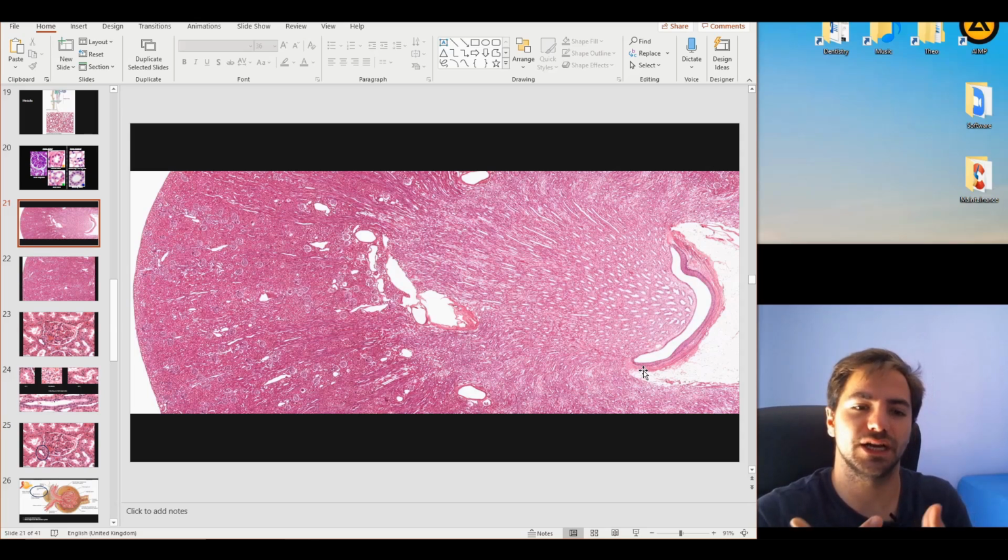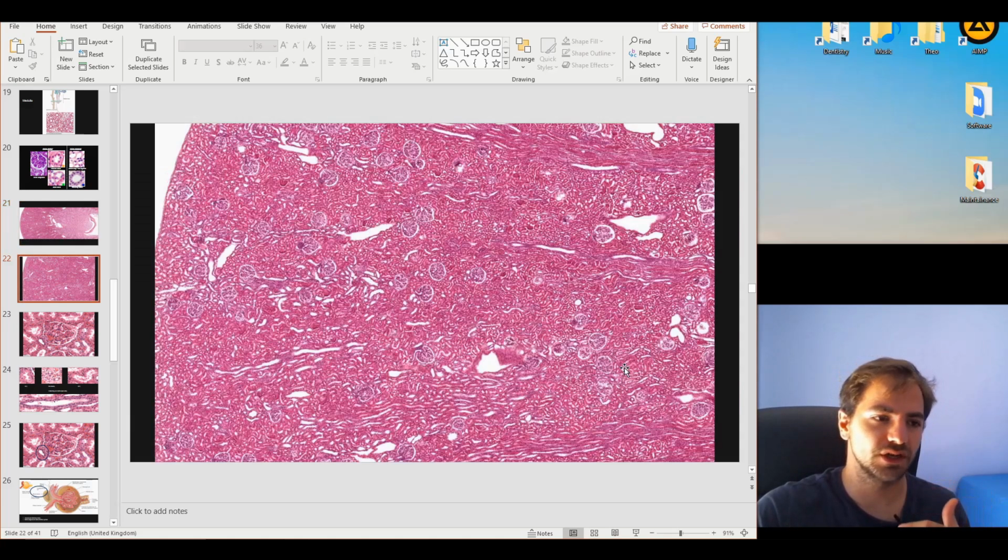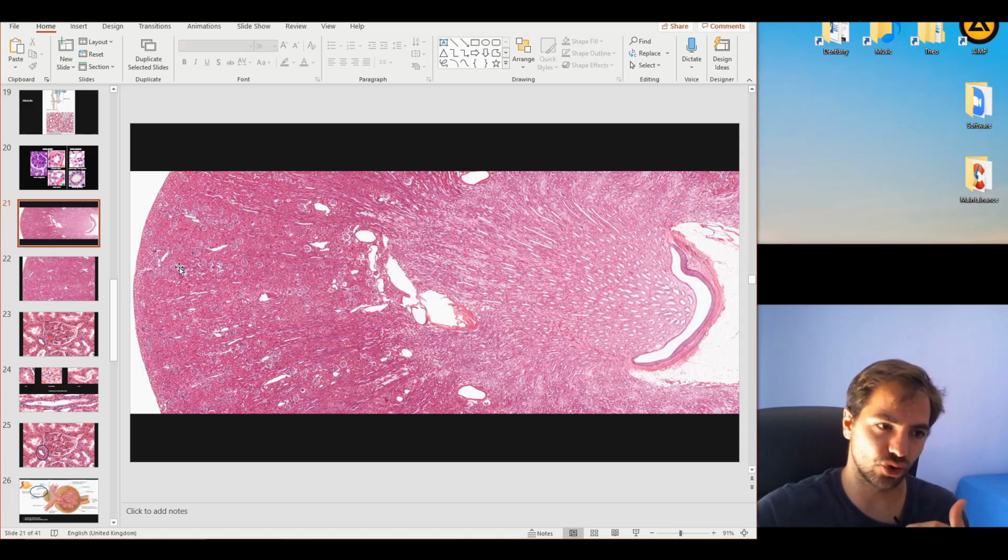Before we move on to see the actual slides from the histology guide, in the beginning I want you to see exactly the ideal examples of what is what. So in the beginning we're going to find this is the cortex and this is the medulla, and it's pretty easy to identify because we're going to find the big typical characteristic of the glomerulus.